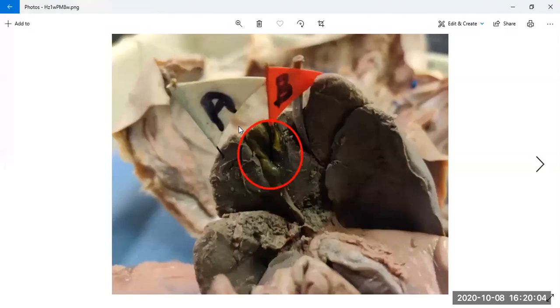Okay. The one labeled A, this one is the liver, which is really important for sugar storage like glycogen, and it is important for red blood cell production, or in general blood cell production. And this structure is the gallbladder, which stores the bile, which is produced by the liver.